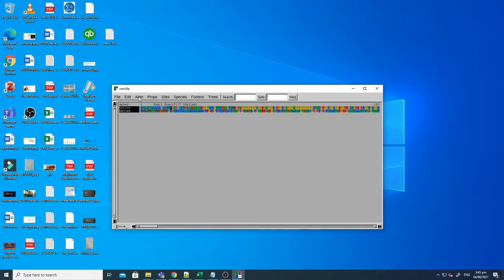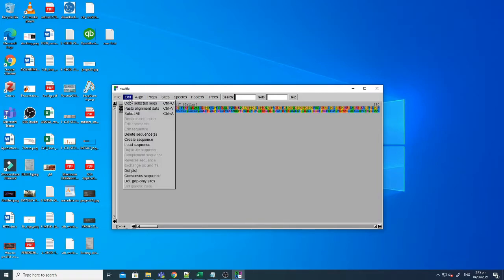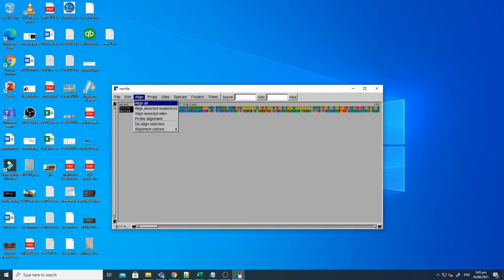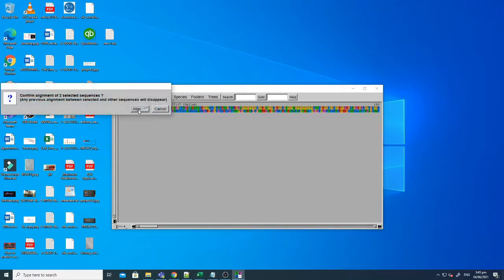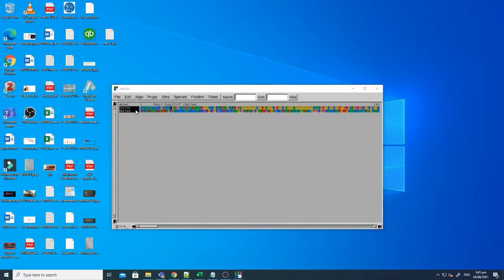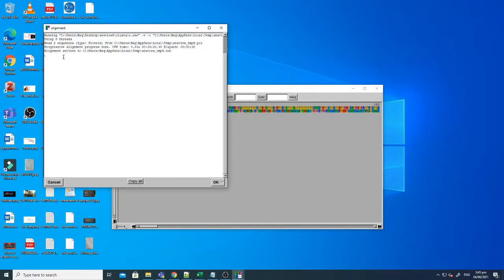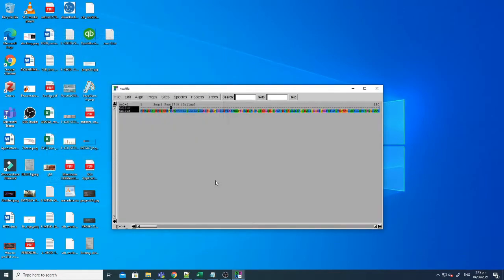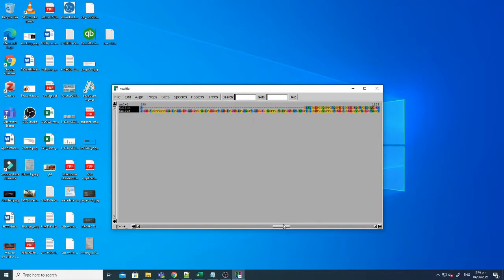Go on the align right and then click align selected sequences and this will directly complete alignment. Right, now the alignment is done. You can see there are a lot of gaps but there are some matches as well.